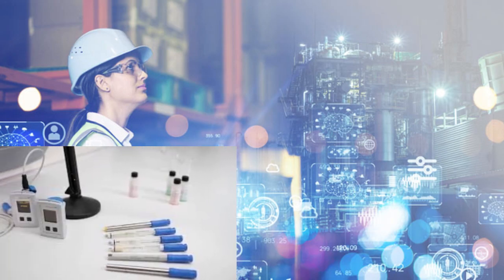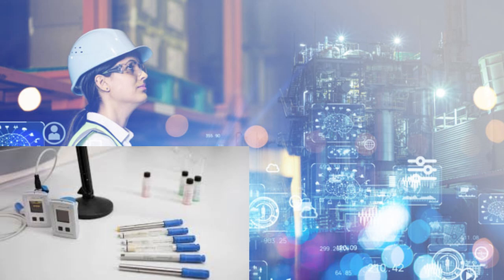But why does this sensor use light with a wavelength of 860 nanometers? Is that just like a science thing? It's not just a random science thing. It's strategic. That wavelength is like a finely tuned radar, perfect for detecting those tiny particles that can make drinking water unsafe. We're talking stuff you can't even see, but this sensor picks them up, like, instantly.